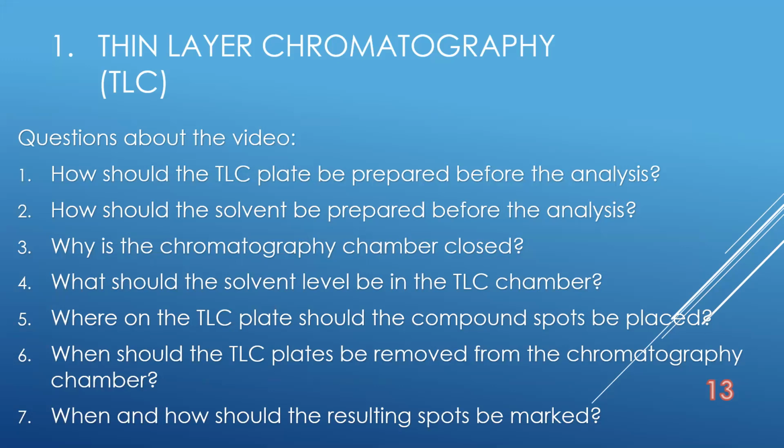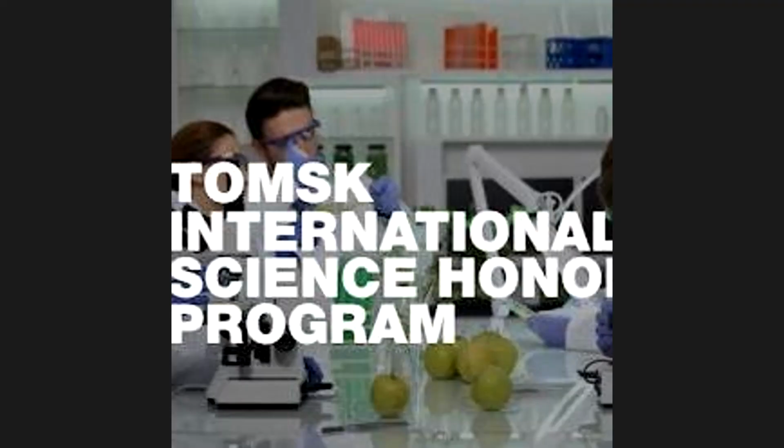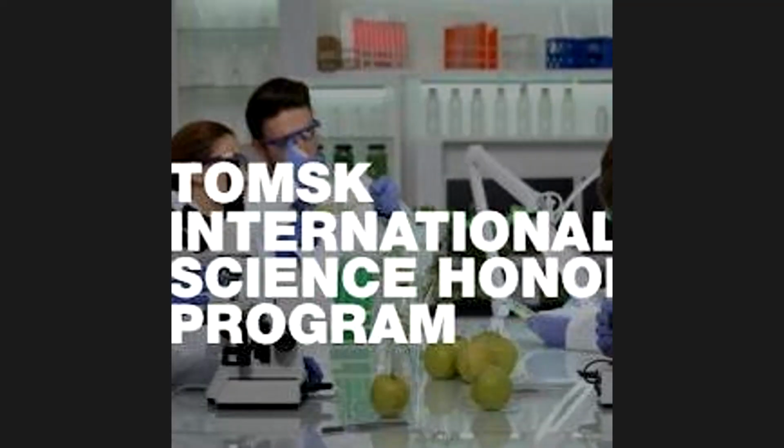You should also write a report about thin layer chromatography in the same way as you made the previous three reports. I also add samples of reports for the previous works, so you could do your reports on the sample of the previous reports.